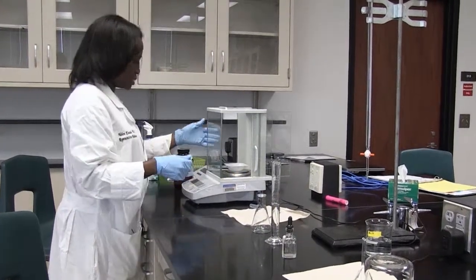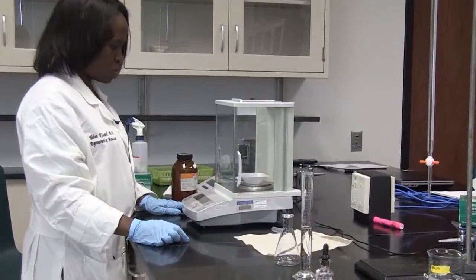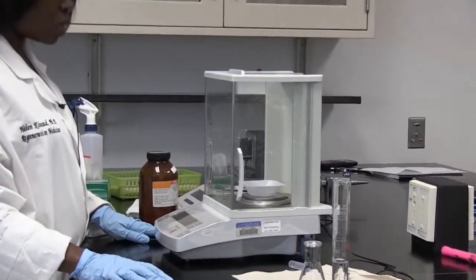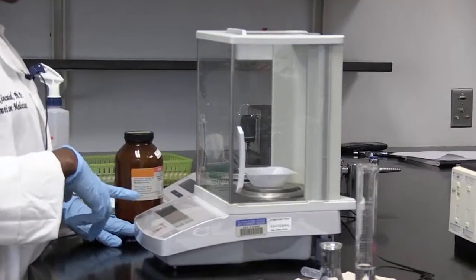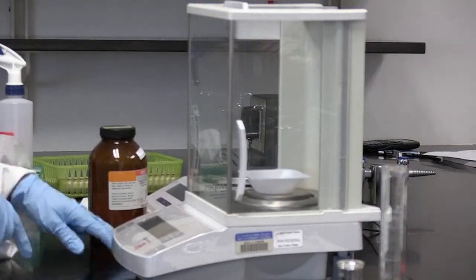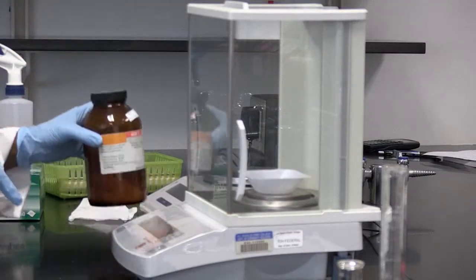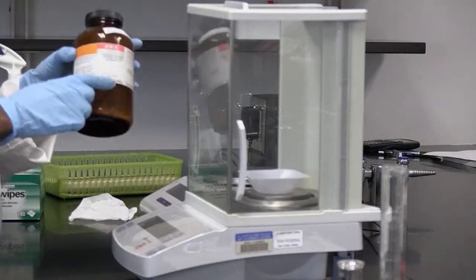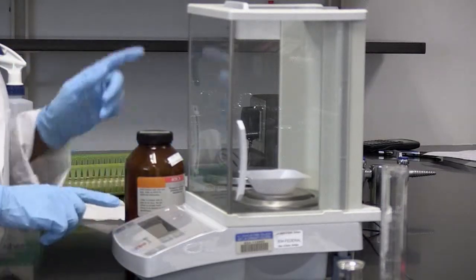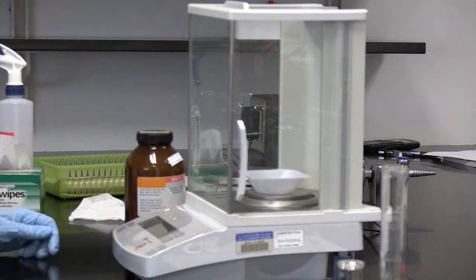What we're going to do in this case, since we're using the weigh boat to do our measurements, is zero or tare with the weigh boat already on our balance. When we do this, the weight that you record will therefore just be the weight of the KHP that we're trying to measure. So we put our boat on the pan and press the zero or tare button.